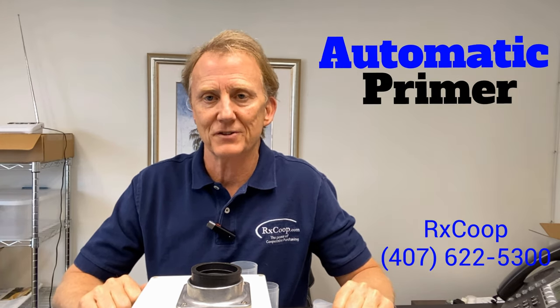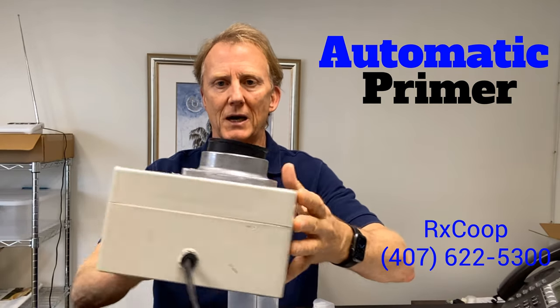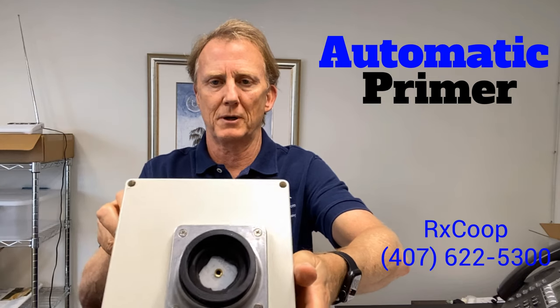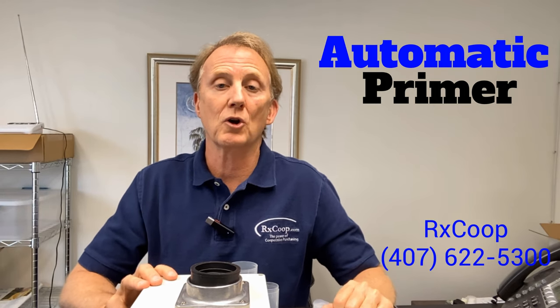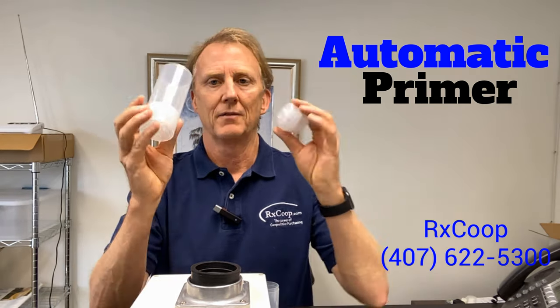Hi everybody, it's Chuck Jackson again with RX Co-op. Today we're going to take a look at our automatic cream pump priming device — this little box right here. It has an electric cord and a power switch on this side, and here is where you place your pumps to prime them. This little device will prime your cream pumps without you having to do anything but hold the pump there.